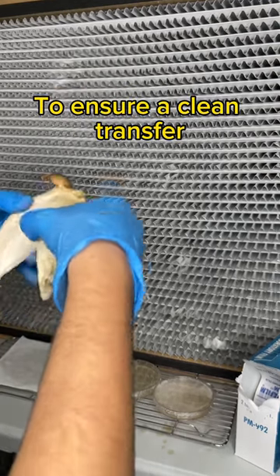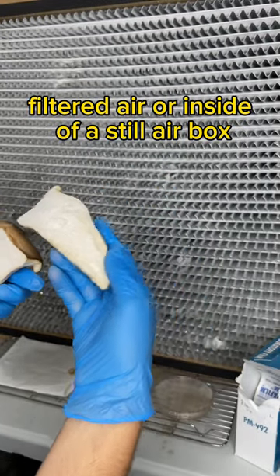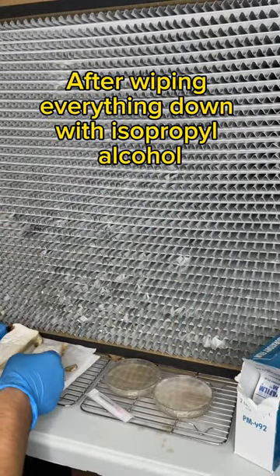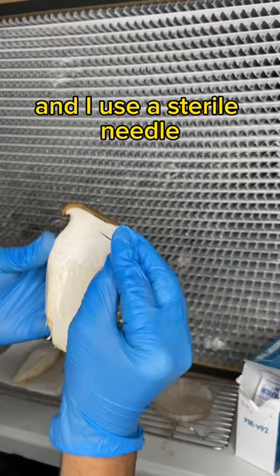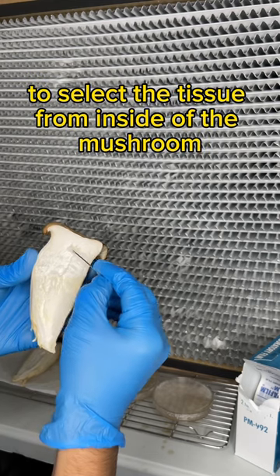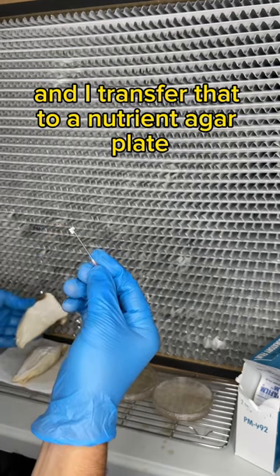To ensure a clean transfer, we have to work in front of HEPA filtered air or inside of a still air box. After wiping everything down with isopropyl alcohol, I cut the mushroom in half with clean scissors and I use a sterile needle to select the tissue from inside of the mushroom and transfer that to a nutrient agar plate.